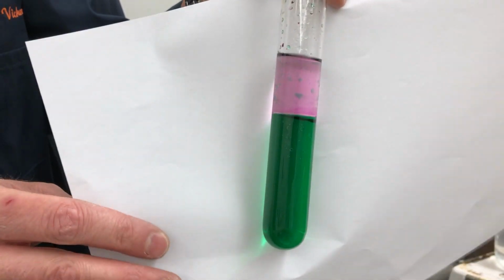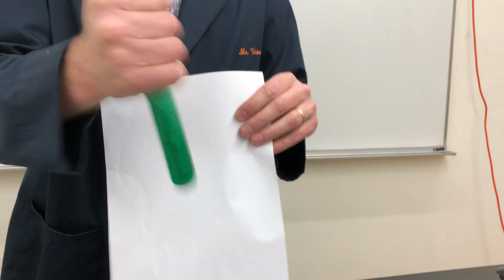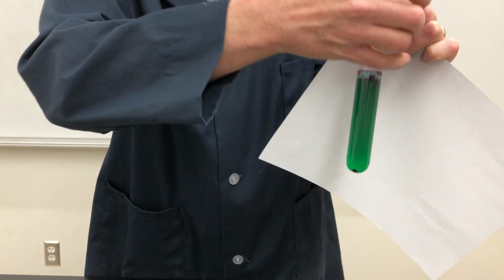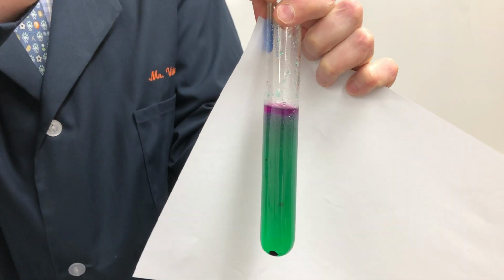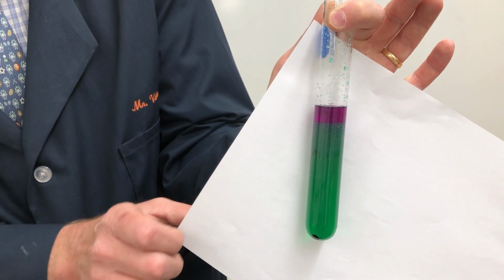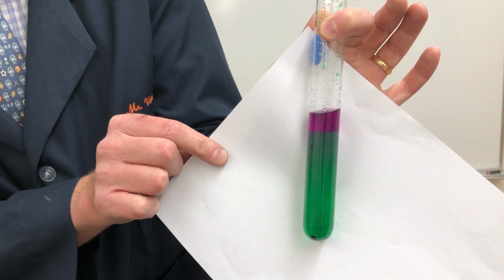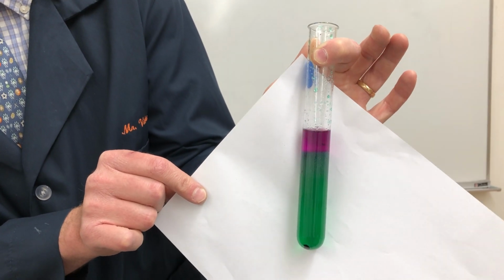Is iodine dissolving in the water, do you think? Let me shake this tube up a little bit. So when I shake that tube up a little bit and the layers separate out again, notice the difference in the hexane layer. What's happened to that? All right, so clearly that's more purple than it was before. What do you think more purple indicates? That is more iodine has dissolved in the hexane layer.